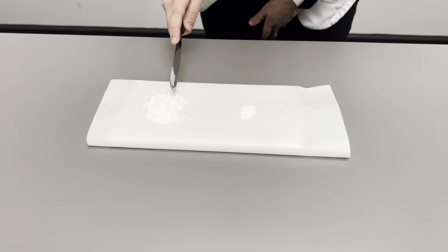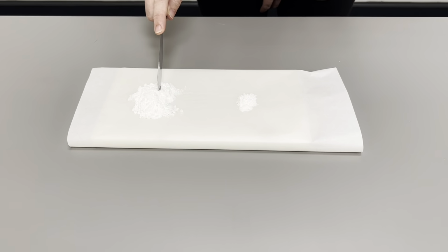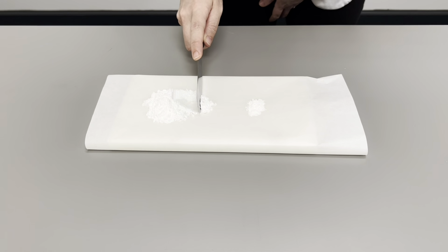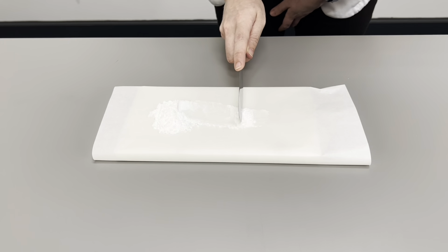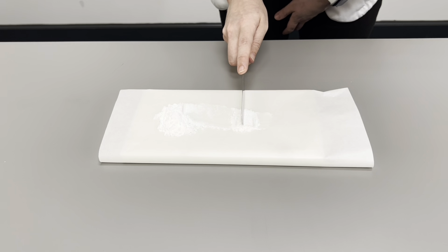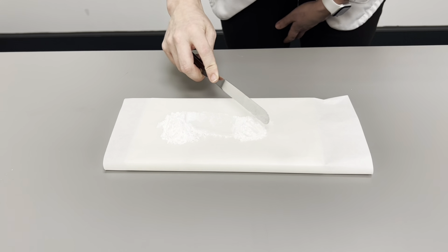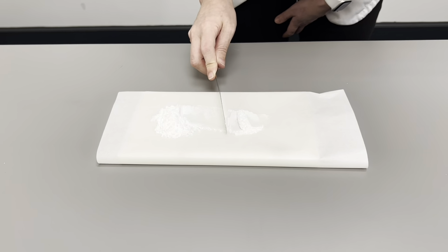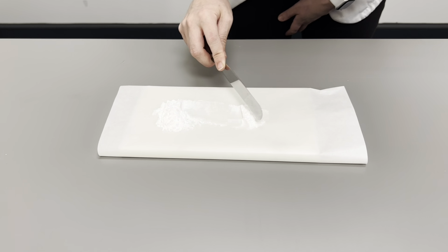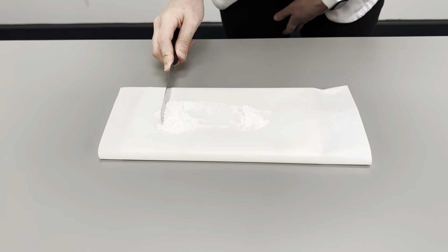You will then visually approximate an equal amount of filler to your drug amount and slide it over to mix with. You will just repeat this motion in a couple different directions until you believe that you've mixed it pretty well. And then you will repeat this step.